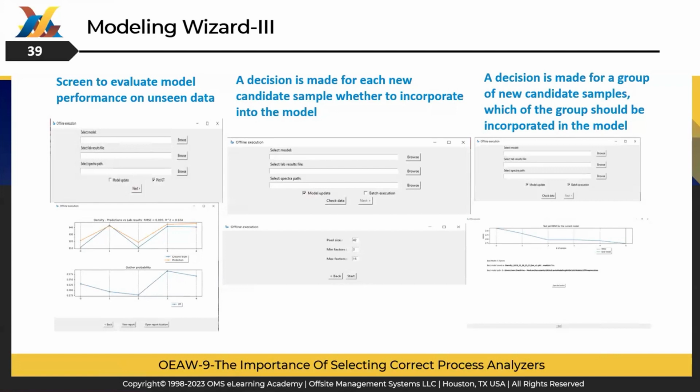Such software also gives you the ability to update an existing model by incorporating new samples, checking the performance of the model in offline regime for development purposes, and much more. To summarize, such software gives the operator a very simple and useful tool for mathematical model operation and maintenance without any need for special tools or skills.